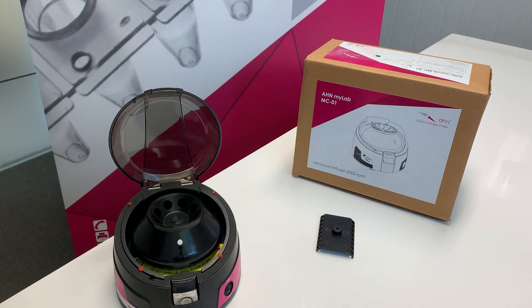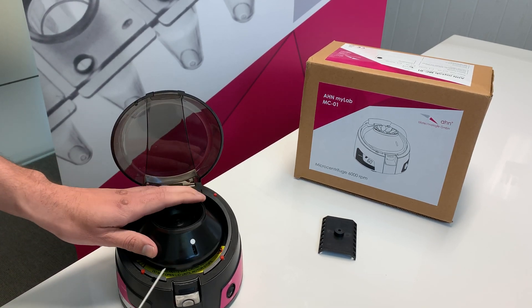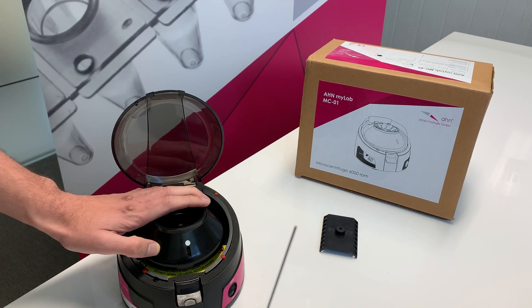Today we are going to show how to remove a rotor from a microcentrifuge. Each microcentrifuge rotor comes with a marked spot — a white spot. The hex key is available inside the box.